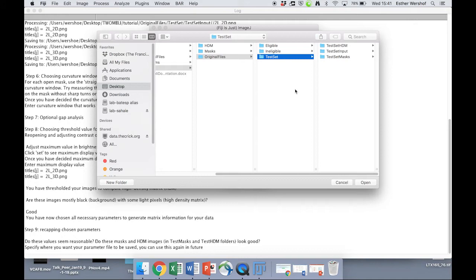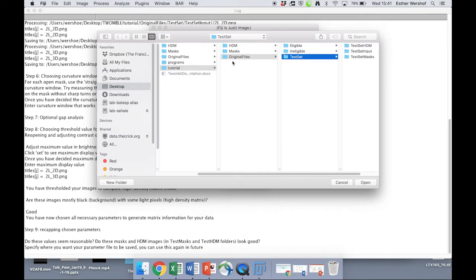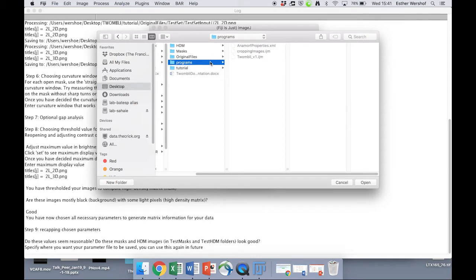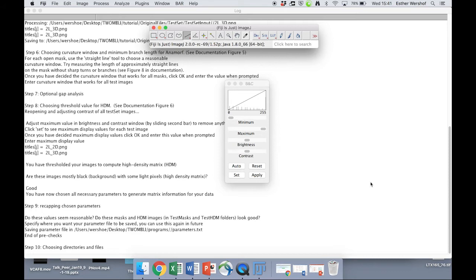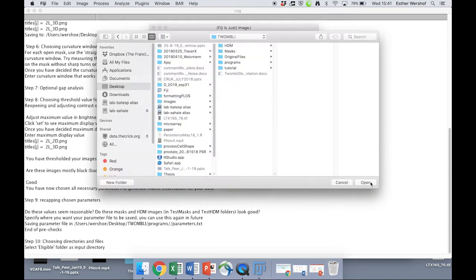Now we are asked by the log to select where we would like this parameter file to be saved. I'd suggest just putting it inside the programs folder and clicking OK. So we've now done the second stage, which is the choosing of parameters.